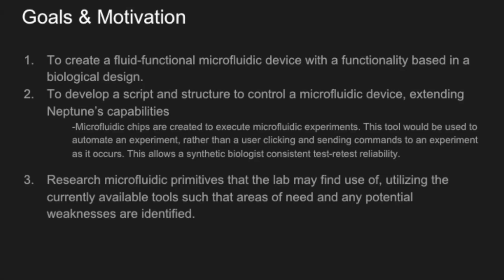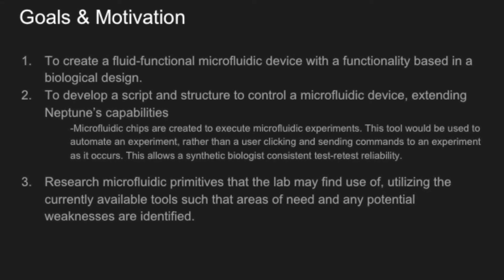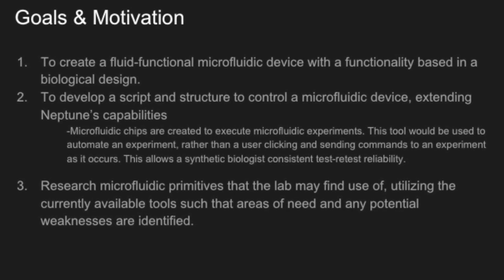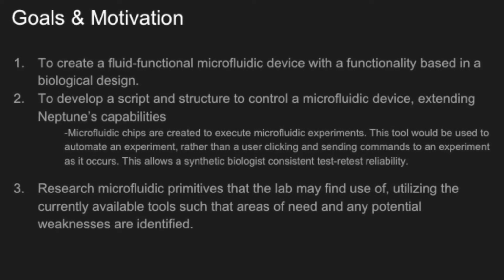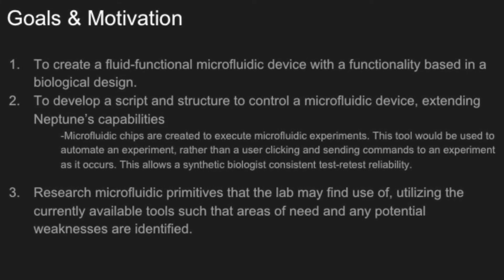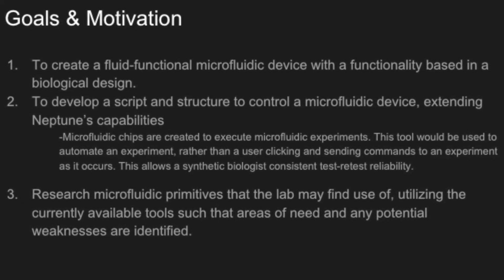The goals of our project were threefold. They were to create a fluid-functional microfluidic device using the tools available from CIDR. Also, to develop a program which can parse a user-entered script and control a biological experiment on a microfluidic device, as per the script's description. This would allow automation of the experiment and provide consistent test-retest reliability. Finally, the third goal was to come up with additional primitives that the lab can make use of as building blocks for more microfluidic experiments.